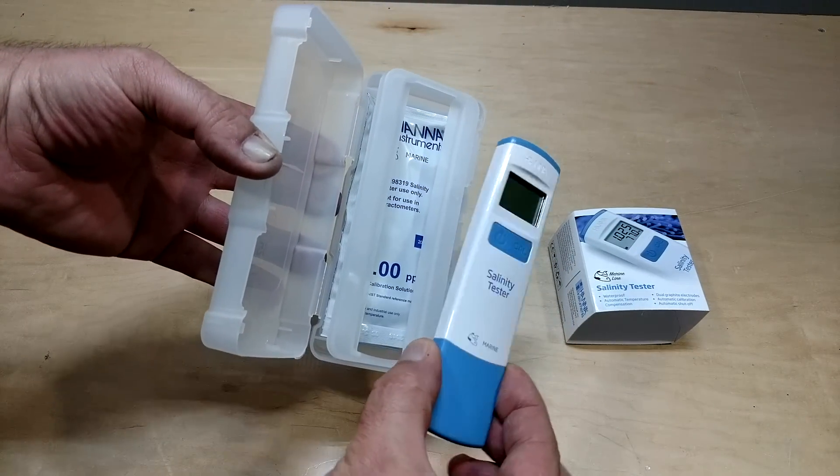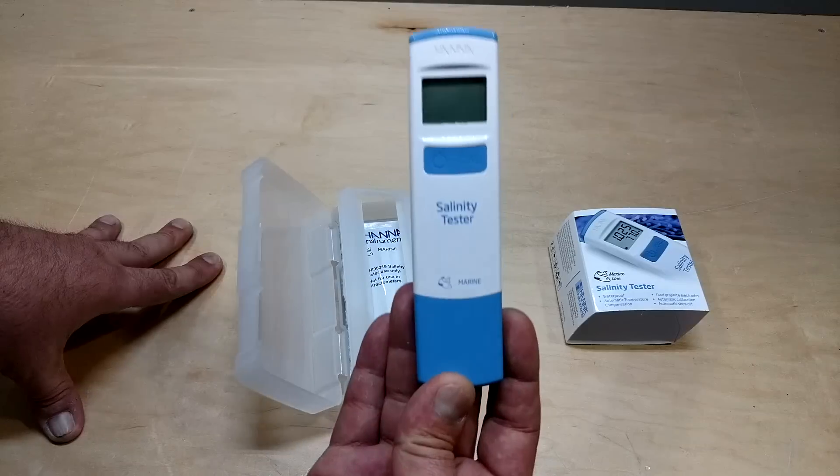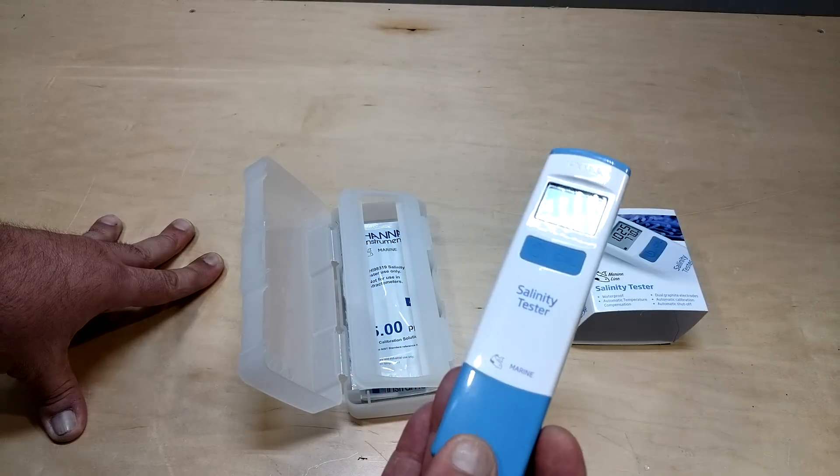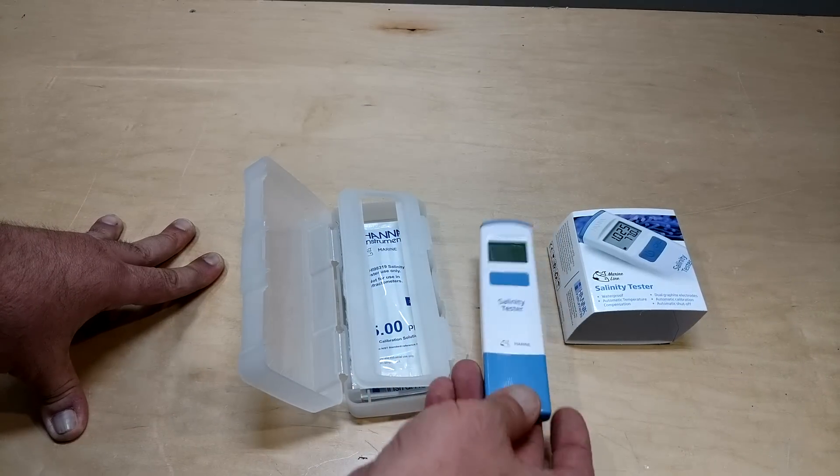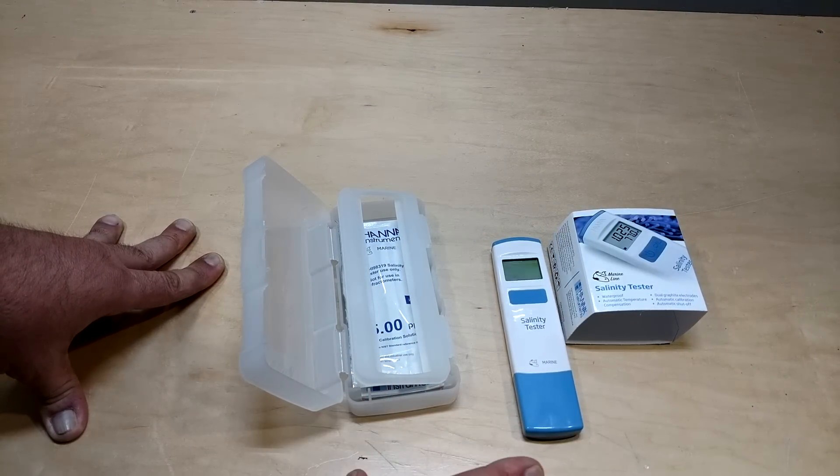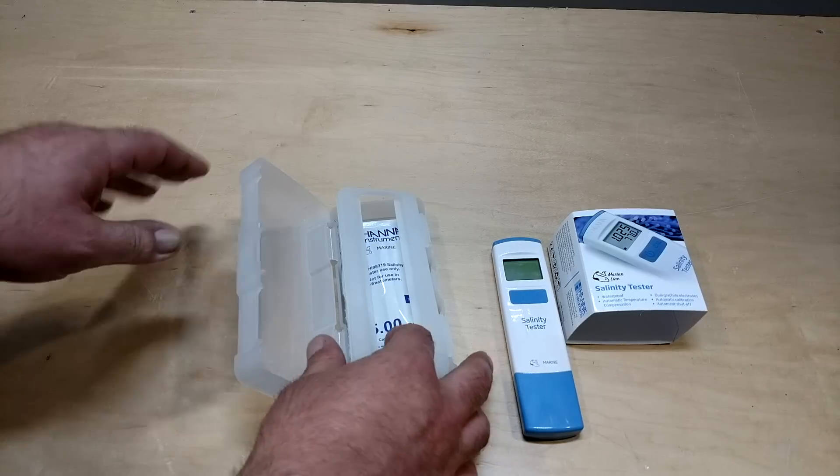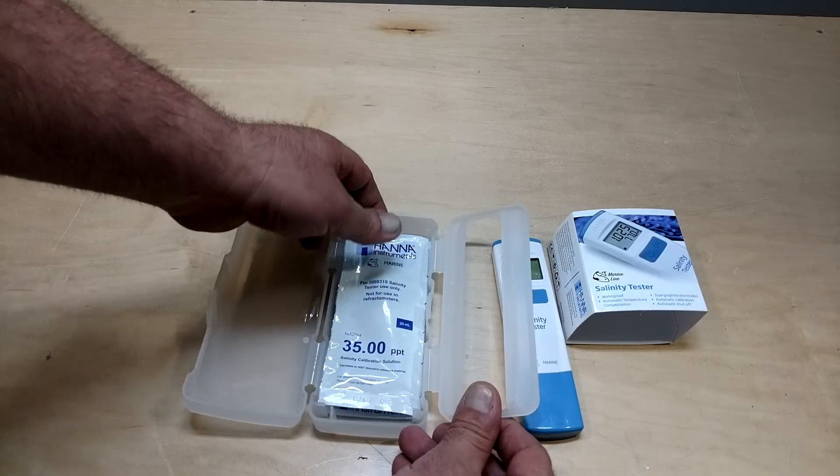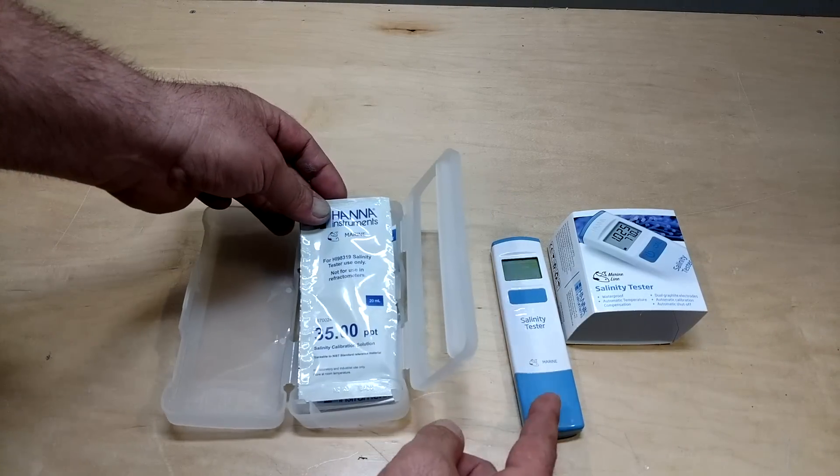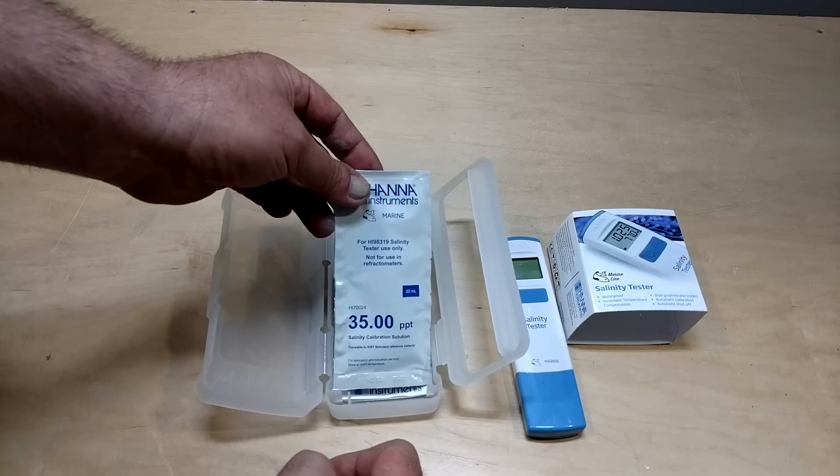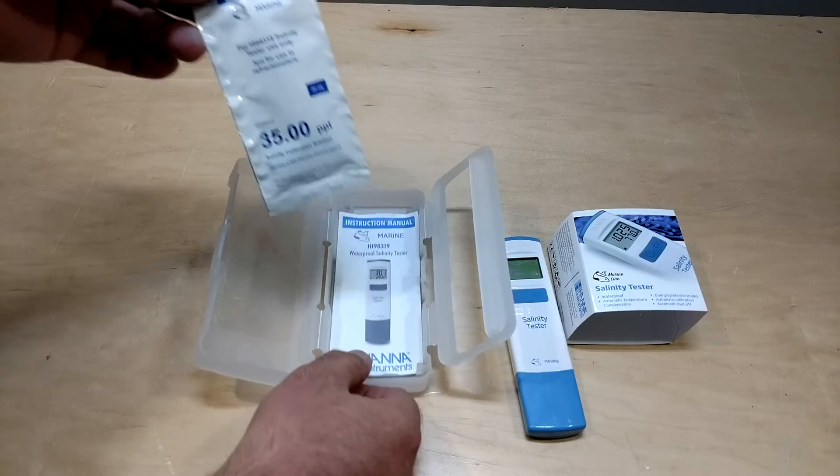So I've been using a refractometer for four years now and I'm officially only using the Hanna Salinity Tester. I still have my refractometer, but it is put to the side and I'm not using it anymore. It's an emergency backup in case I lose this, I step on it, I break it, I throw it into a volcano. You never know what could happen.